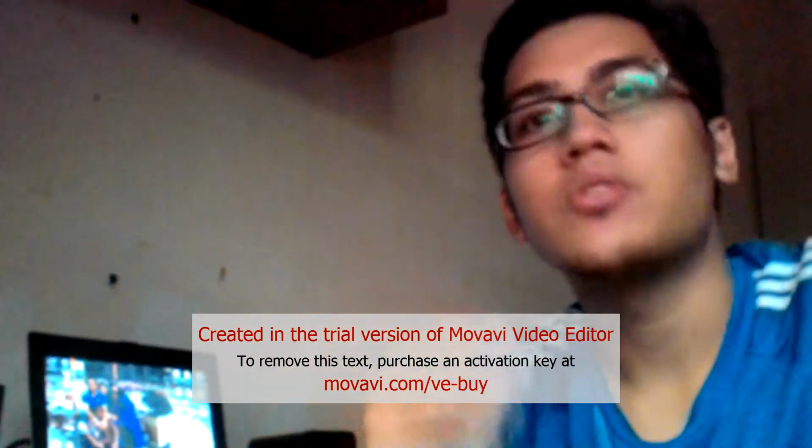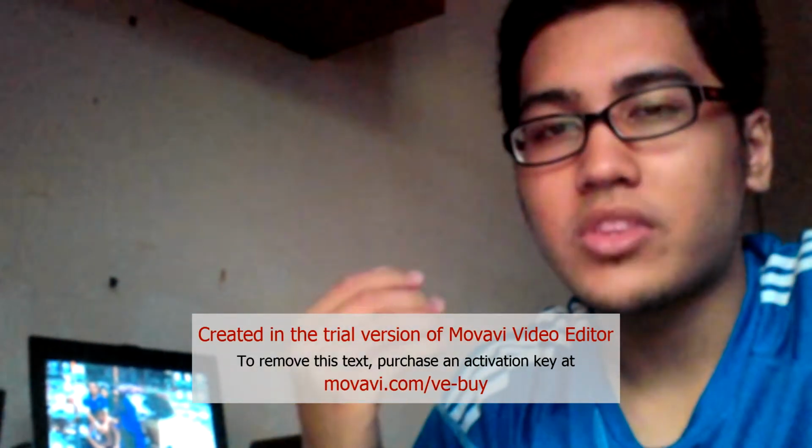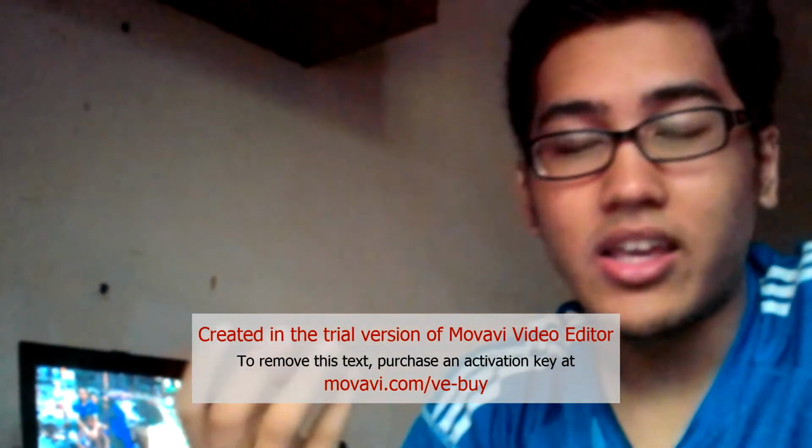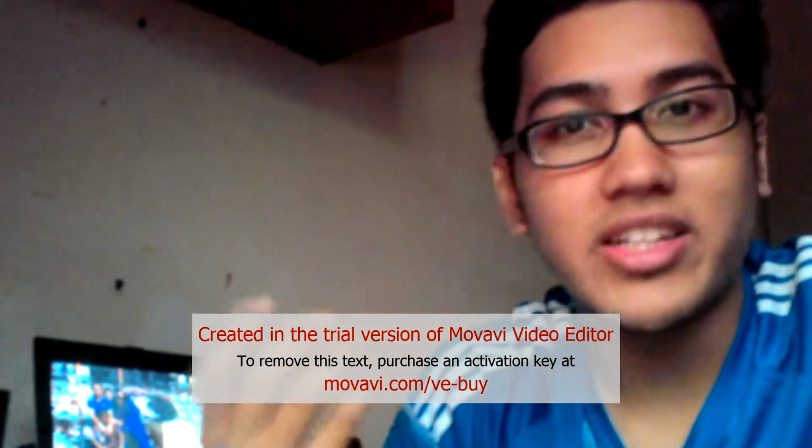And for information also, using this light, it also generates light, but it doesn't generate any heat. So by this sort of advantage, we're able to avoid any temperature levels that can detriment the algae development.